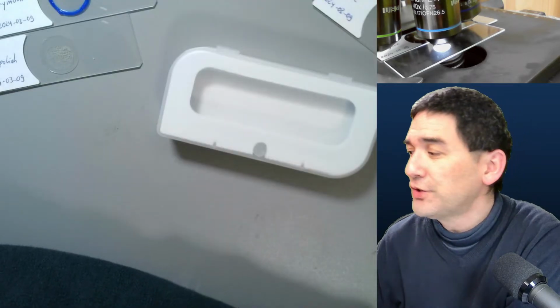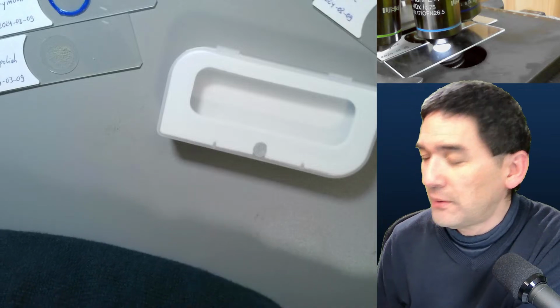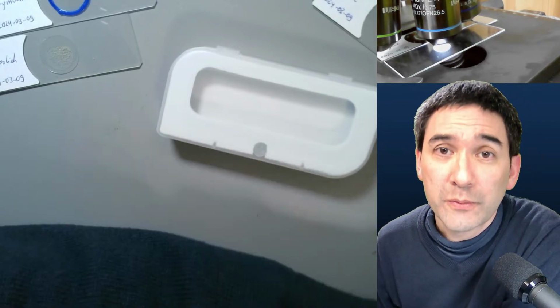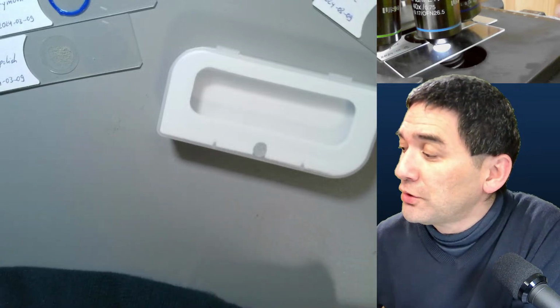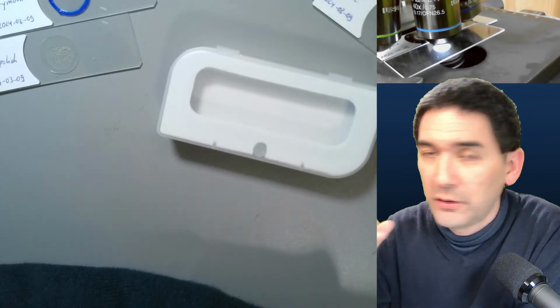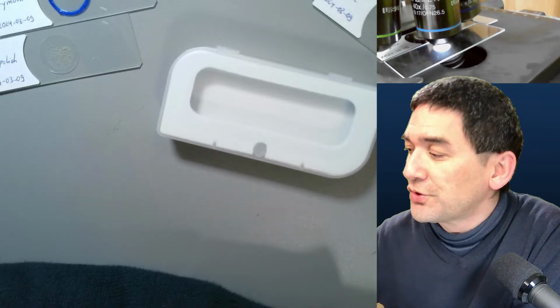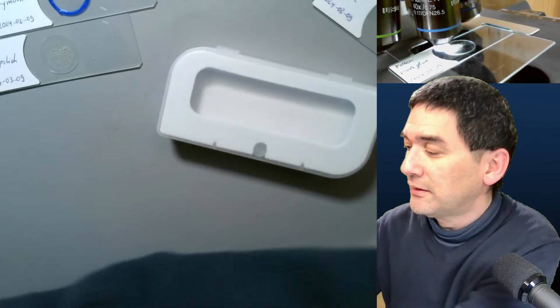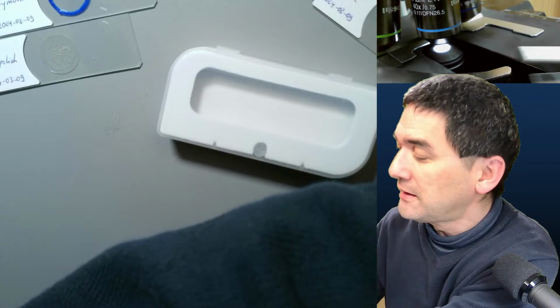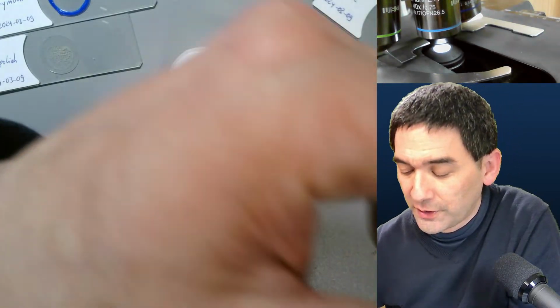For this reason, a direct measurement gives you a much more precise and accurate result. You can also put a ruler under the microscope, and using low power, calculate the magnification and the size. But I think I'm going to save that for another live stream.